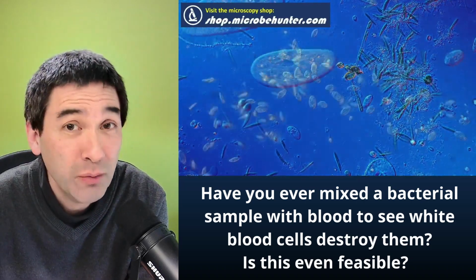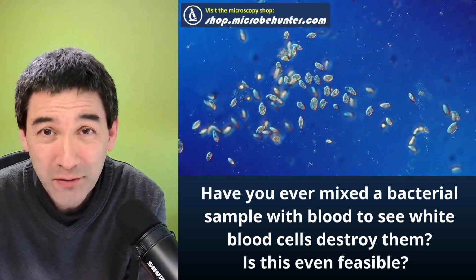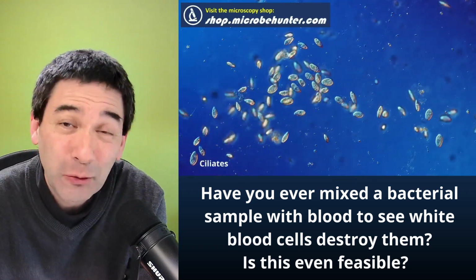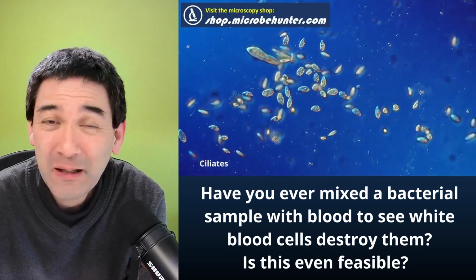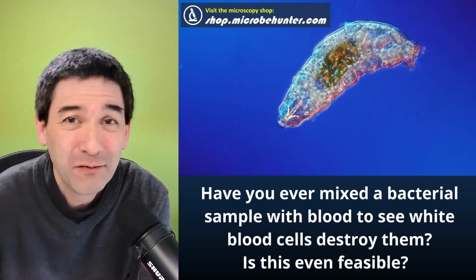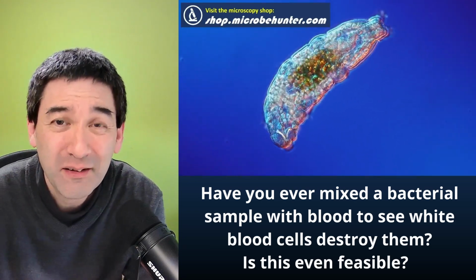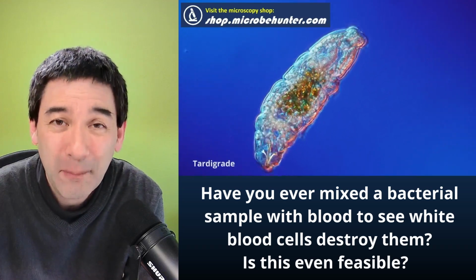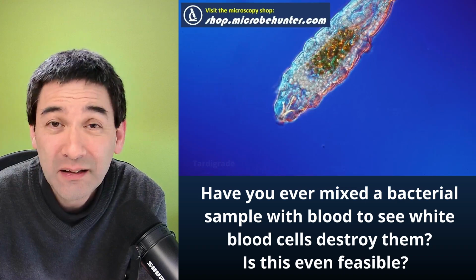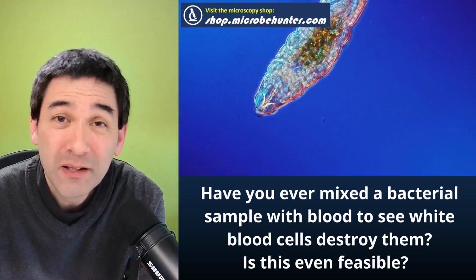Now, if you actually were to grow your own bacteria, even if they're safe ones, and if you take a small sample of a bacterial colony, for example, and mix it with blood, I do not think that this is going to work because there are going to be millions and millions of bacteria in an extremely small sample, and for this reason, you have to dilute it down, of course. And then the concentration of the bacteria goes down.